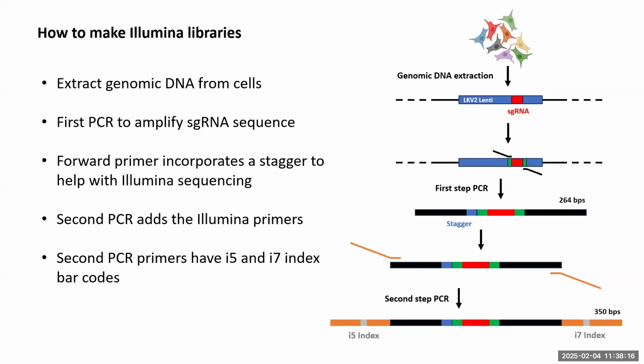Yes? So the first PCR is just to amplify, so you have more of your sequence for adding the barcoding. Yeah, it's essentially to get rid of, you've got all this genomic DNA, 6.6 micrograms, and most of that's DNA that you're not interested in. So you're just wanting to create an amplicon you can then easily sequence and gives you the guide sequence.